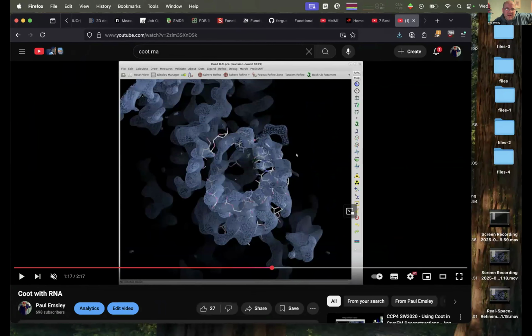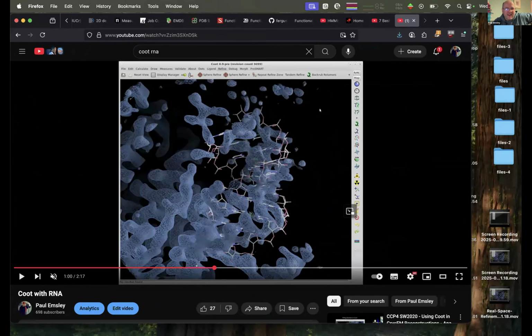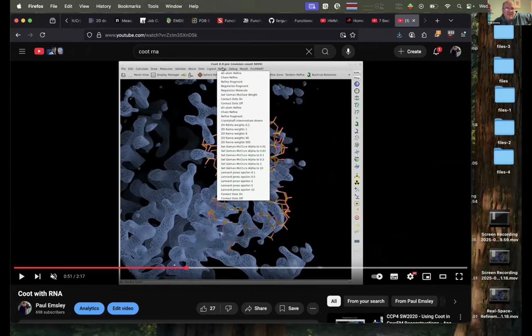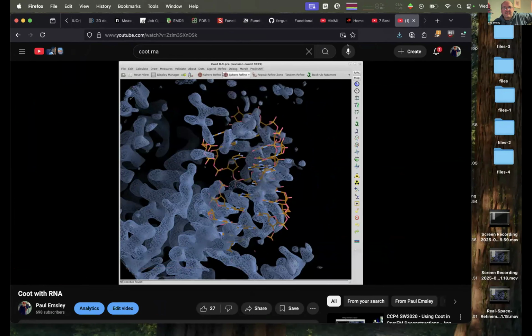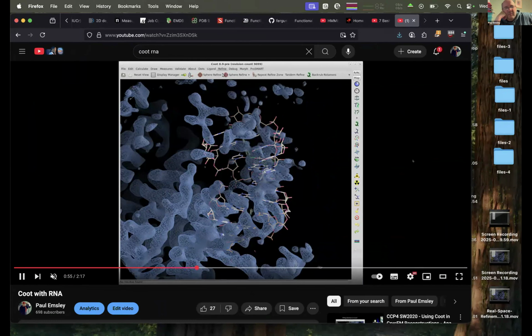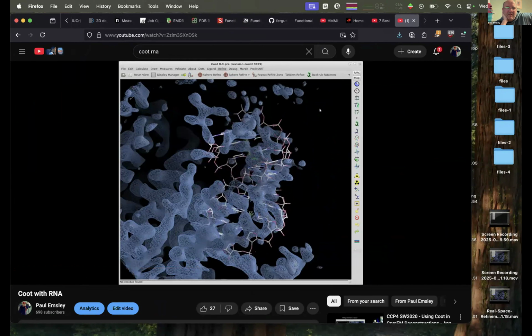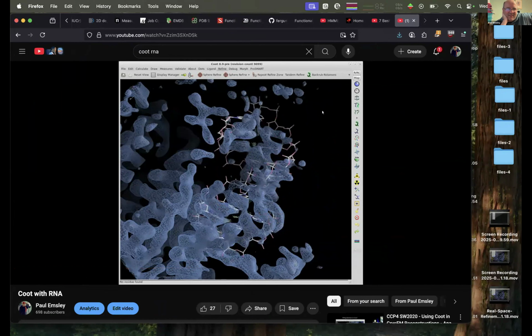To about here. Right. So local distance restraints plus base pairing plus stacking. And we start off with something that, yeah, that's about right. Right, all atom refine. The GUIs are all completely rewritten now. So it's moving slowly, so it's moving through. It'll be 3 or 4 times faster these days with the modern computers.